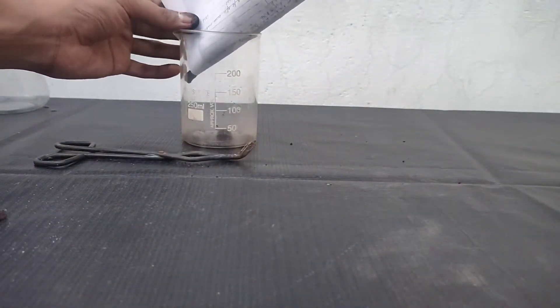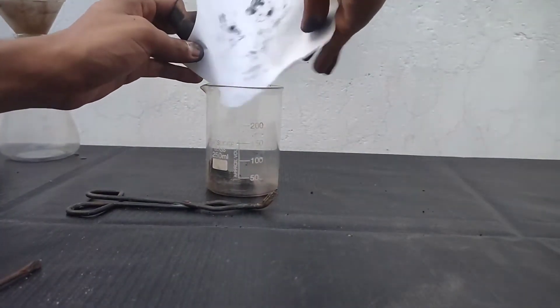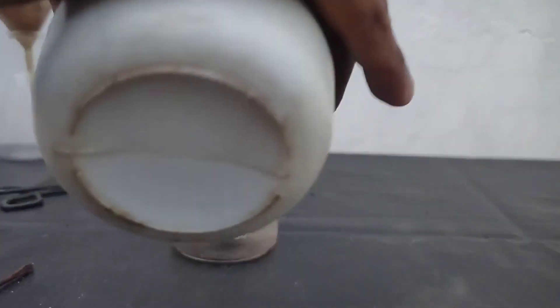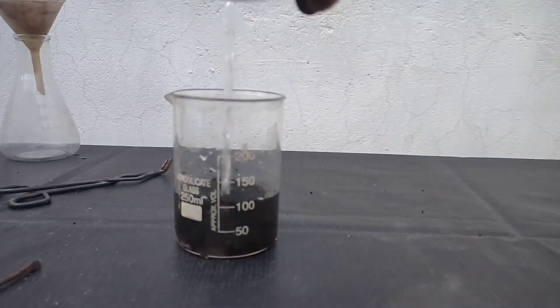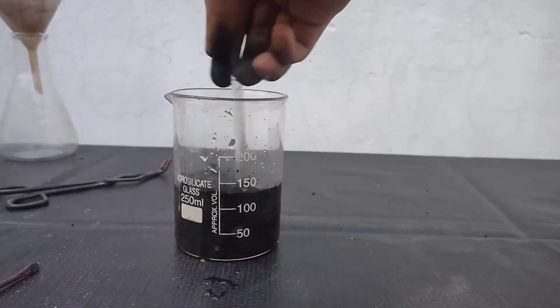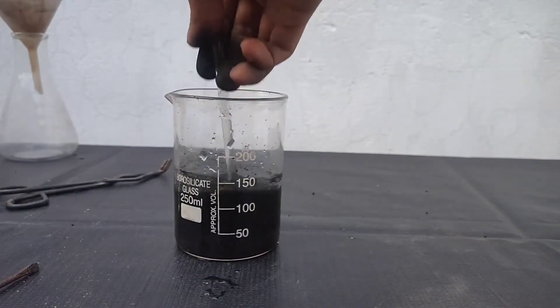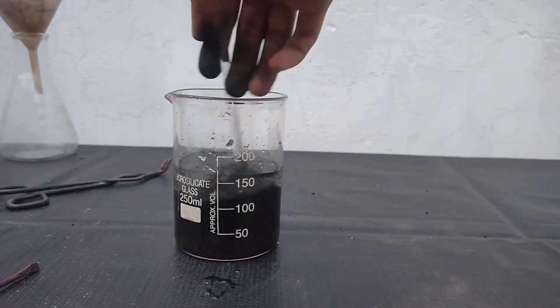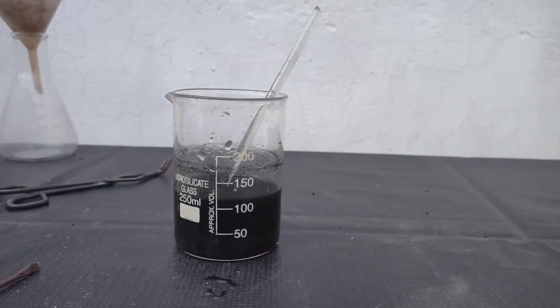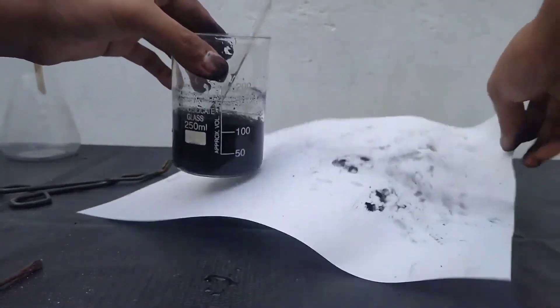Now I will be pouring all the black powder into a beaker. To this, I will be adding water, and then I will stir it so that all the soluble substances could dissolve. I will stir it for some time, break the lumps, and then leave it for around 1 to 2 hours so that all the soluble substances could completely dissolve.